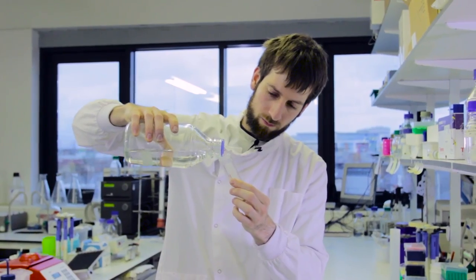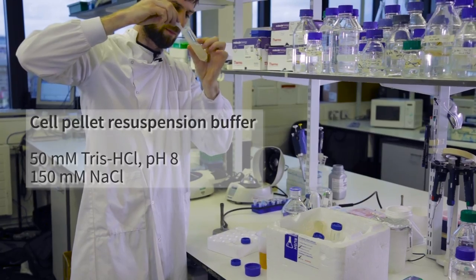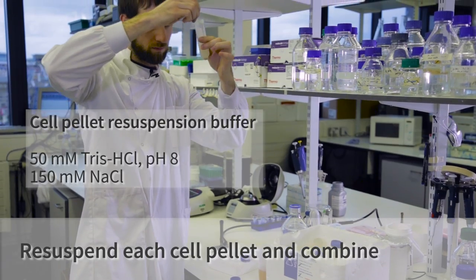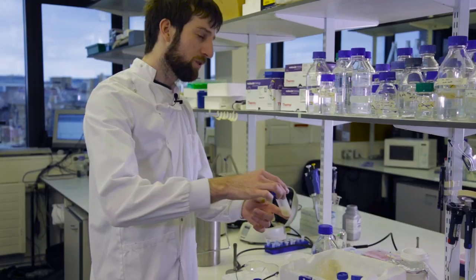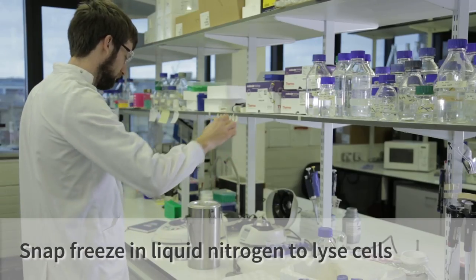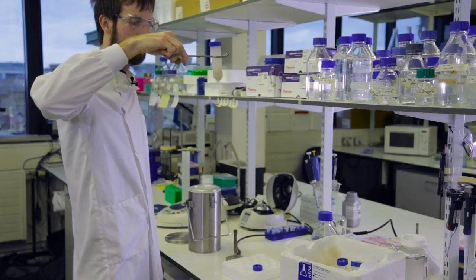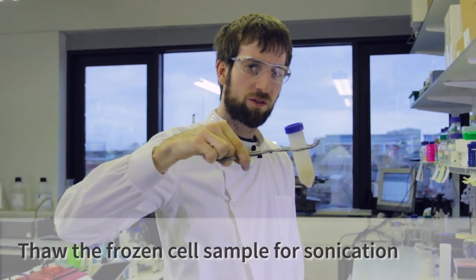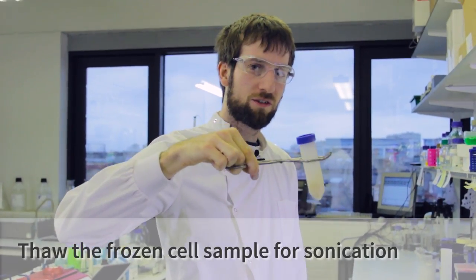We're going to resuspend the pellet using a buffer. Now we've resuspended all of the cells and we're going to snap freeze it in liquid nitrogen to lyse open the cells and break our protein away from the cells. We have snap frozen cells and protein, hopefully starting to burst open the cells. We need to thaw this so that we can go to the next stage of lysis, sonication.